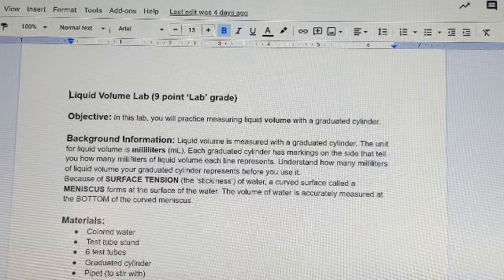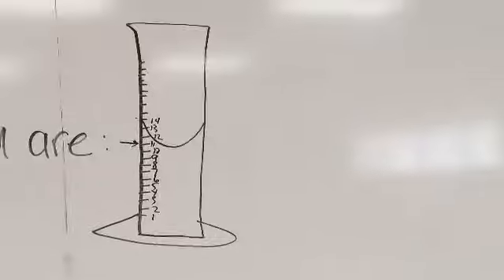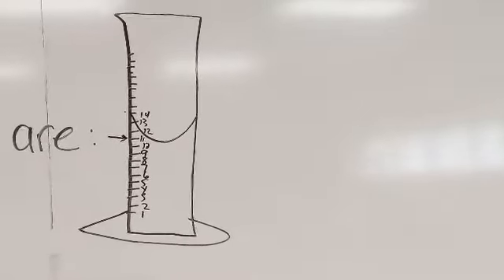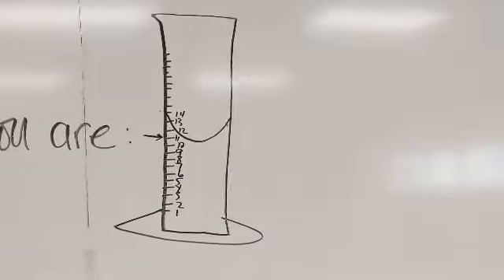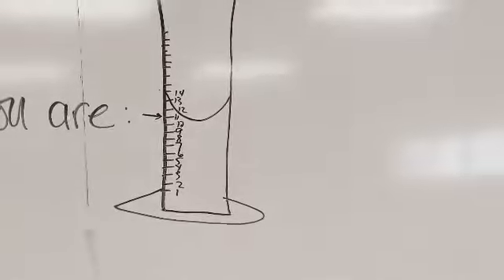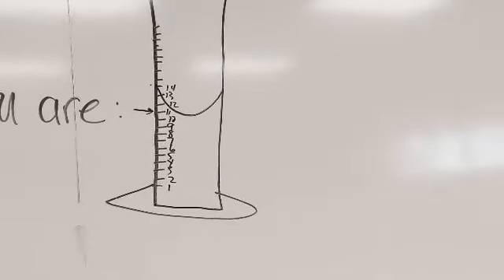Now I have an illustration that I want to show you to help you understand just what the meniscus is. I drew a little illustration of a graduated cylinder, and it's very exaggerated. But this right here, this curved surface, is called the meniscus. Now in reality, it's not as exaggerated of a curve as I make it in this illustration.